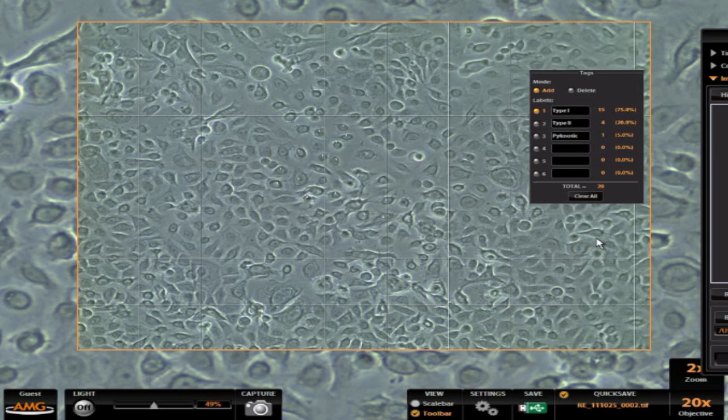It's a very nice feature for the microscope. It works equally well with our EVOS FL fluorescence microscope. And with that microscope, people are often counting fluorescence overlays with transmitted light so that they can look at, say, GFP expression in a subpopulation of cells. With this tool, it's very easy to go in and count all of the cells that are expressing versus the ones that aren't and get a nice estimation of transfection efficiency.